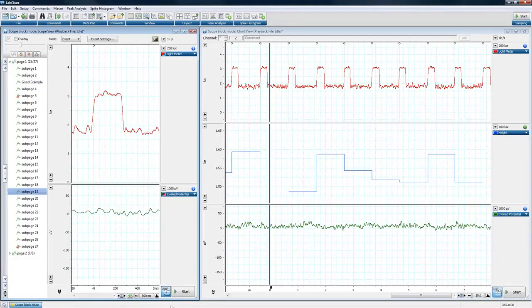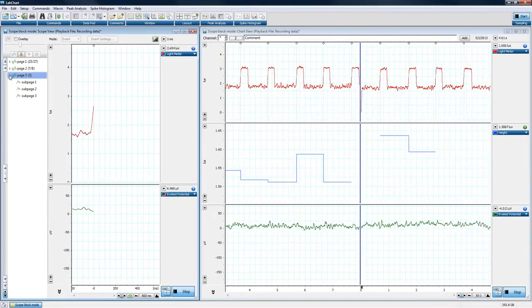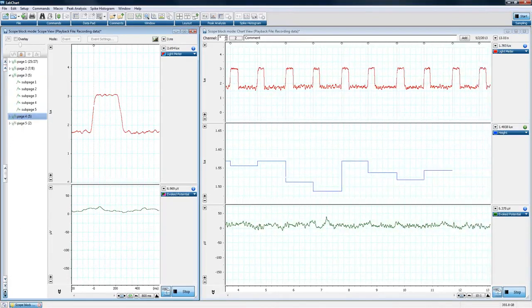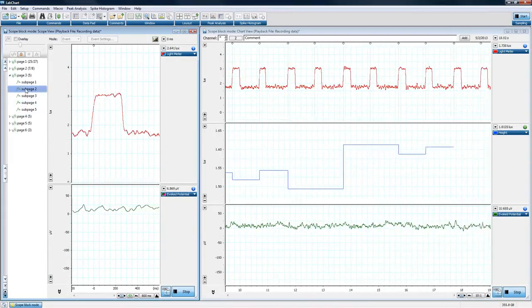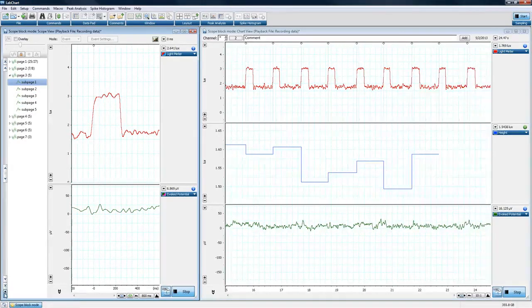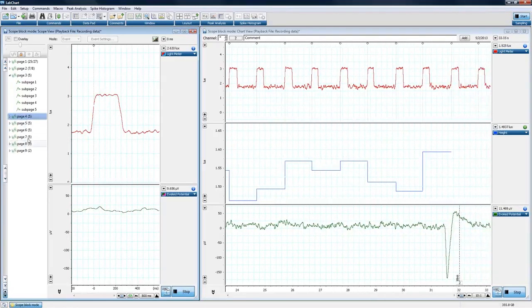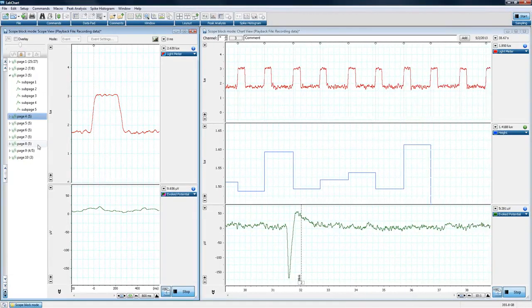a good example, or you can name it whatever you'd like. As we're continuously recording, one of the things we can do, as we've done before, is look at the latest subpage. That's what we're looking at now. This button down here, if I'm reviewing old ones, which is what I'm doing by clicking on these different pages, says when I hover over it, toggle always show latest page while sampling. If I click on that, it's always going to show me the latest page. It's a nice little tool to jump ahead or go back and review things. So that's a good overview of the scope view.